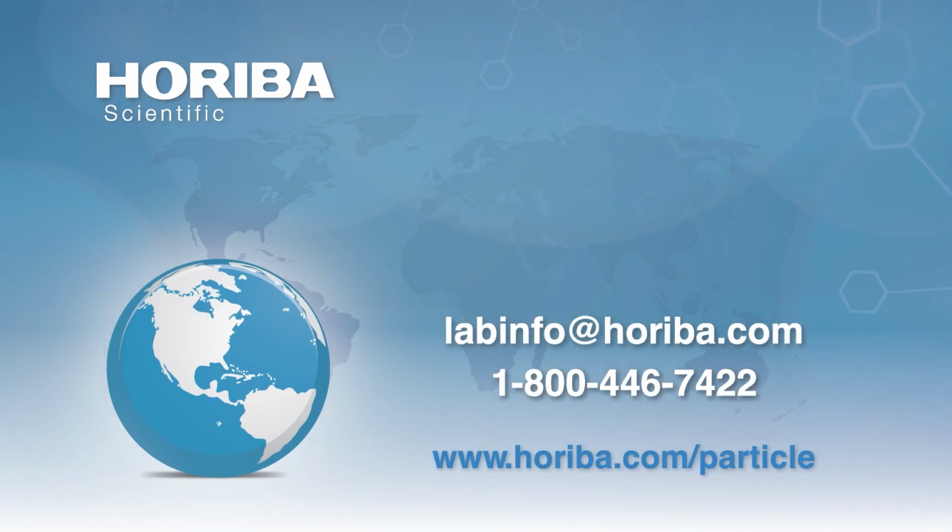Thank you. What about polymers? Is this applicable to isolating large polymer molecules with low concentration in the sample? Yeah, that's one of the things we didn't really touch on, but if you do the line start procedure, essentially you're doing a separation of the large ones from the medium ones from the small ones. And so if for some reason you said, geez, I want to look at these few big ones that came down, you could stop the experiment in the middle and pipette off the large ones that are on the bottom and study them separate from the entire distribution.